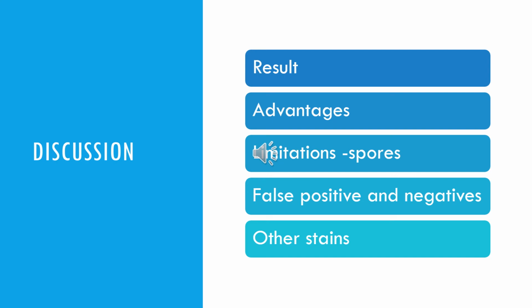The advantages of gram staining are it gives quick results, it's simple and cost-efficient, helps determine appropriate treatments for infections, can be used with different media, and is a key method in identifying bacteria. There are limitations, such as it cannot identify past whether it is gram-positive or negative, it cannot stain spores, and results can lead to misinterpretation. False results can happen from errors in the steps, such as over-decolorizing and washing off the dye before it has enough time to seep into the cell wall.